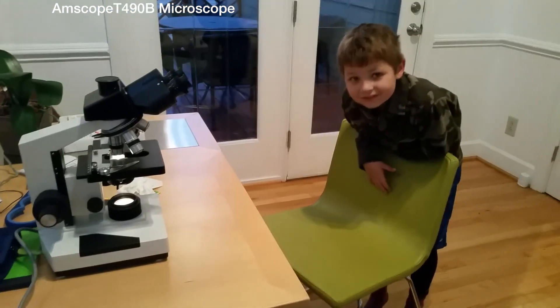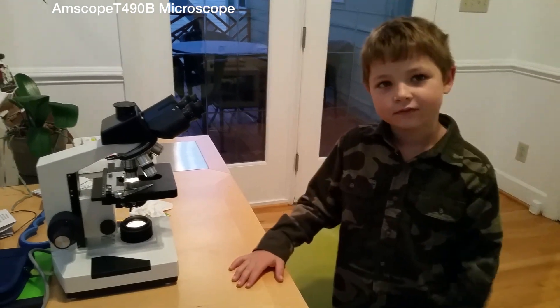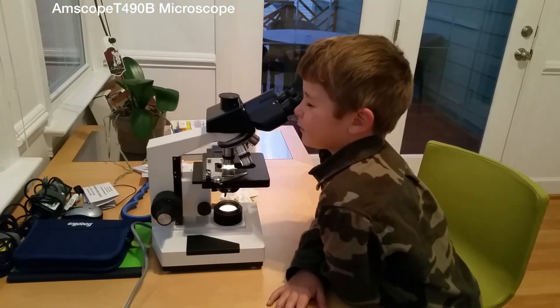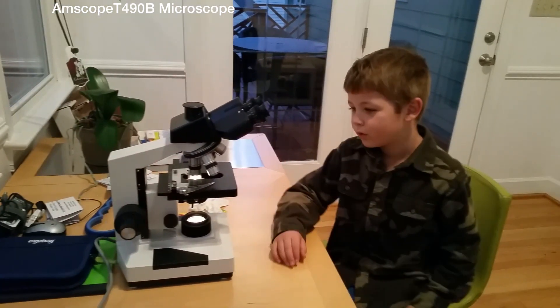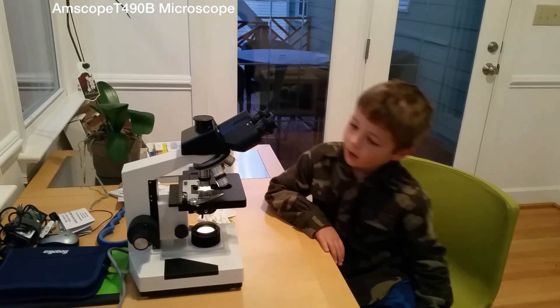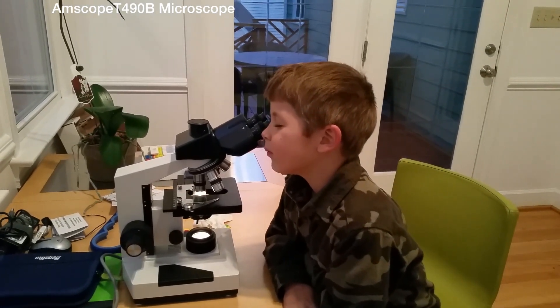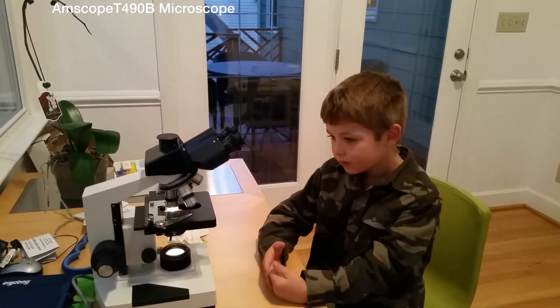Alright, Mr. Lars, this is 800 magnification, supposedly, of the mold, the bread mold. Take a look at it. What do you think? Go up there. What do you see under there? Still dots connected. A chain of circles, basically? Yeah.